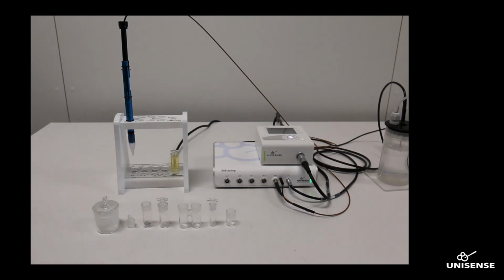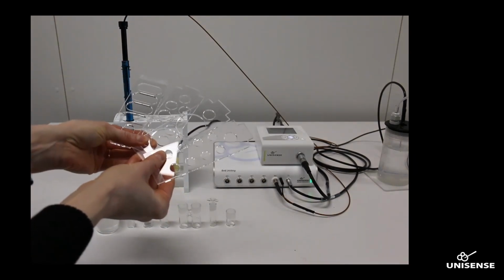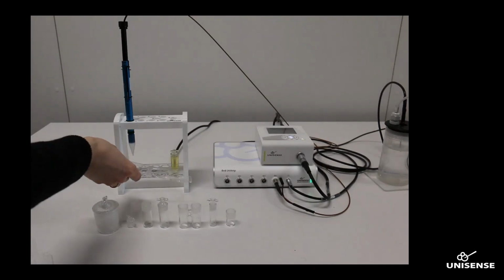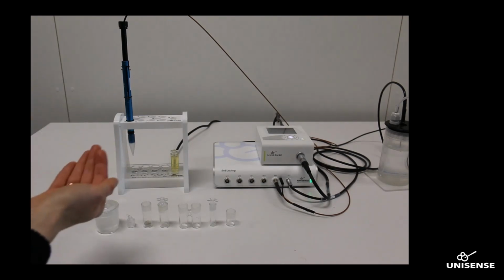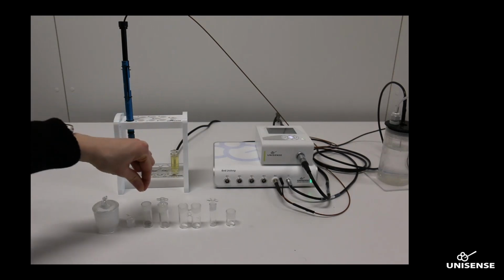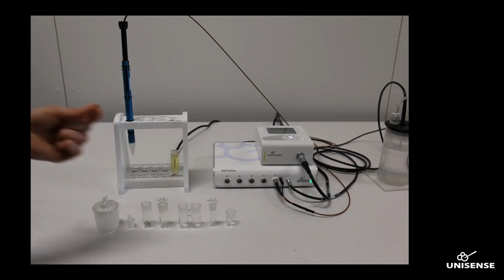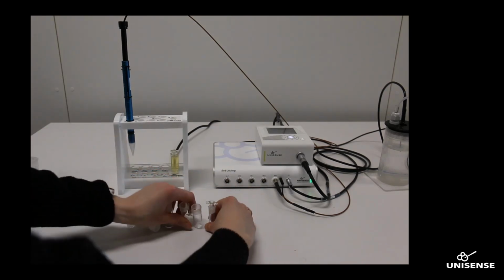For the rack here, we have different types of plates, and they fit with the different sizes of chambers. So if you, for instance, are working with the larger chambers, you just put this plate with 2 large holes into the stirrer rack here. For the stirring, we have these small glass-coated magnets that you put into the chambers. Never use Teflon magnets. They can simply take up the oxygen and mess up your measurements. So always use glass-coated magnets. Yep, so I will just remove the chambers here.